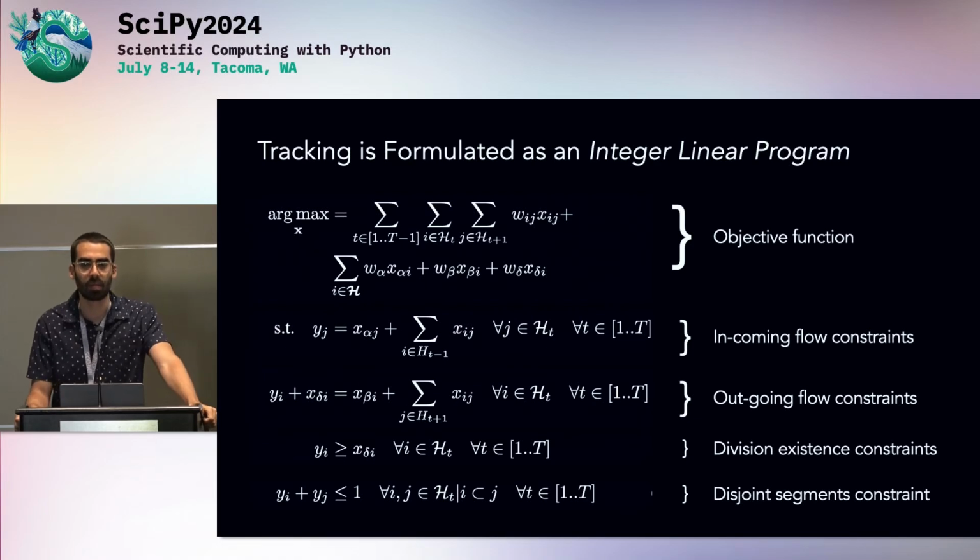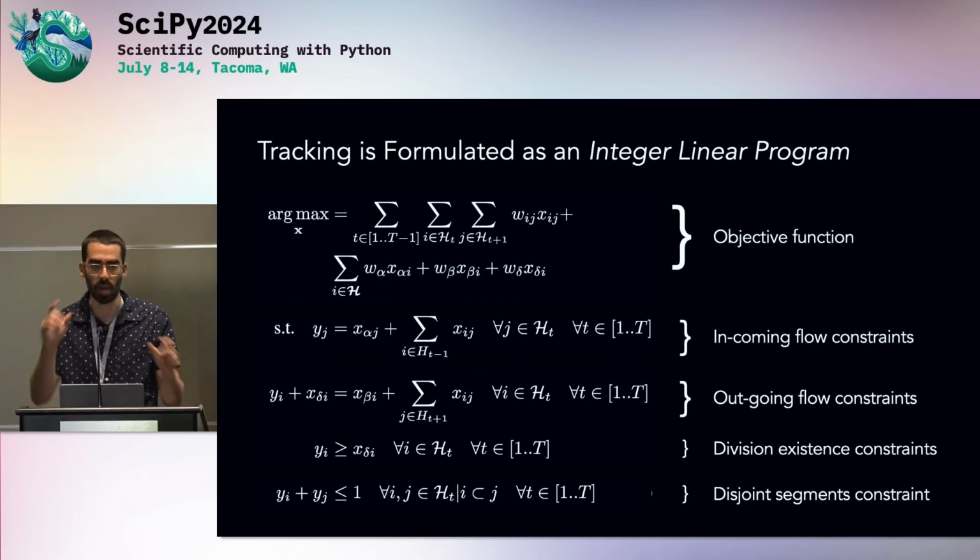Okay, got it. And so when a new cell comes up, then it's assigned a new cell identity. Is that right? Kind of, because we assign the identities afterwards. The actual result we have is just a binary variable indicating the connections, if this cell is associated to the next one. Got it.